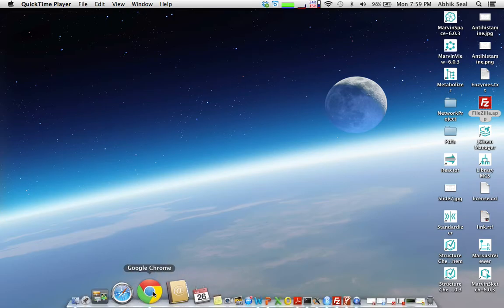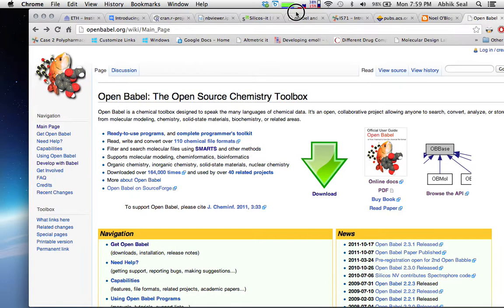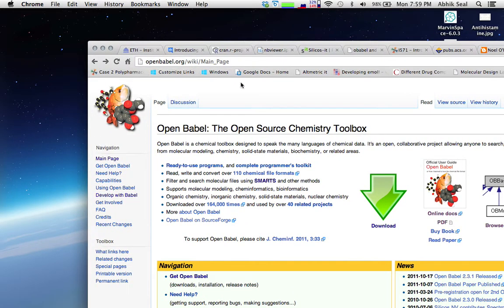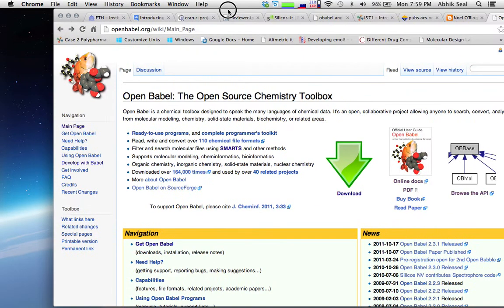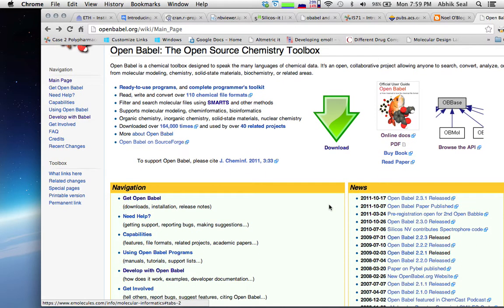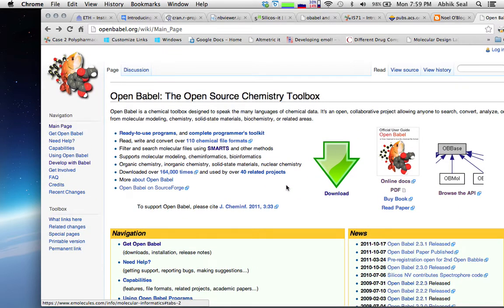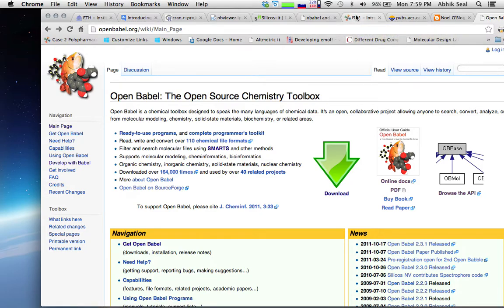Hello, today I'll be showing you how to work with the Open Babel toolkit. You can download Open Babel from the openbabel.org wiki main page. It is available for Mac, Linux, and Windows. Apart from Open Babel, today we'll be using it to learn how we can filter compounds.